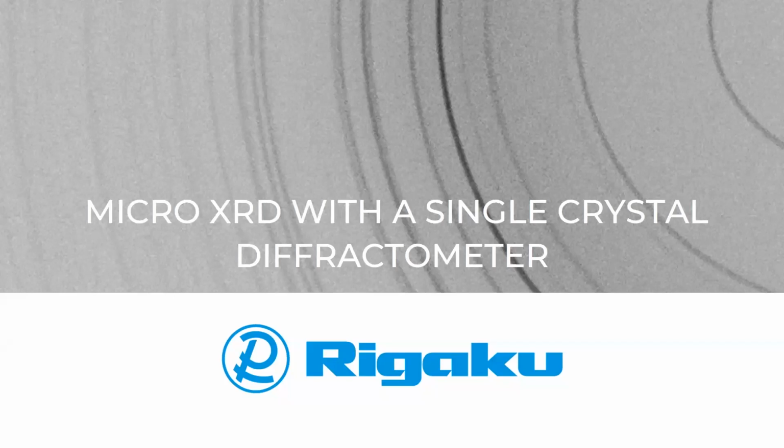This webinar is concerned with the collection of powder data from a single crystal instrument using only micrograms of powder.